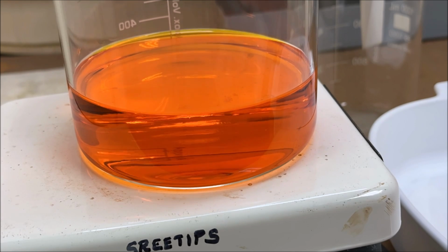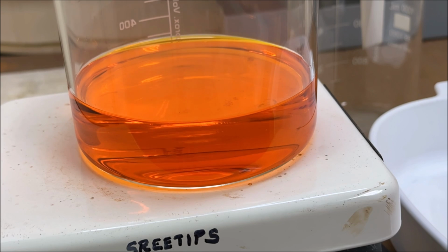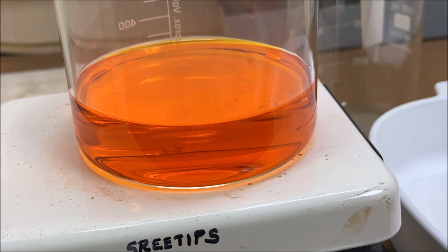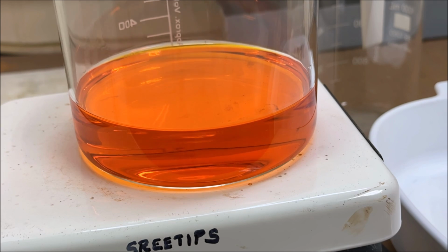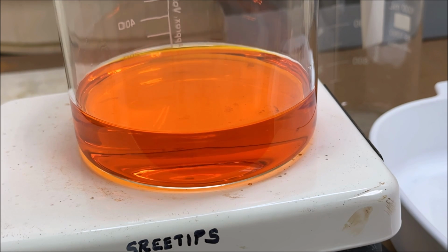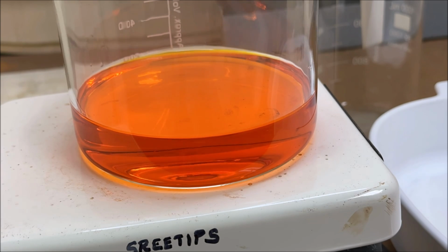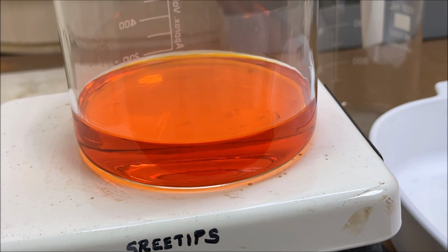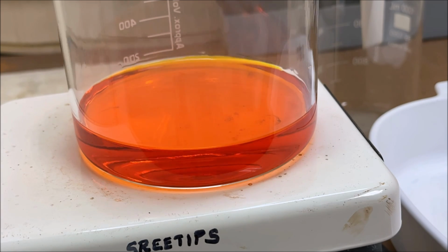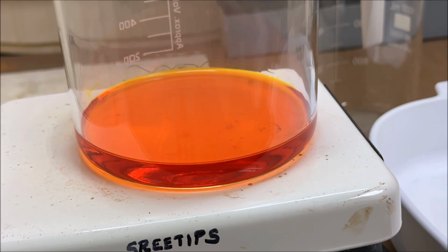I had some other footage of this. It was much more volume than this I started out with, and the camera died right away, so I didn't get much footage of the evaporation. But this is the entire amount. There's about 43 grams of pure gold in that solution. And I went over to help my daughter hang up a picture, and I left it on the heat, and it got crispy.